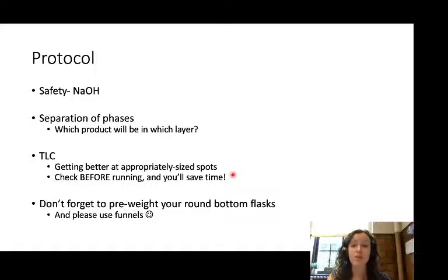Additionally, check those TLC plates before you put them in the chamber. If the spots are too big to begin with, go ahead and prep a new plate before wasting your time running it and then determining that the plate isn't any good.